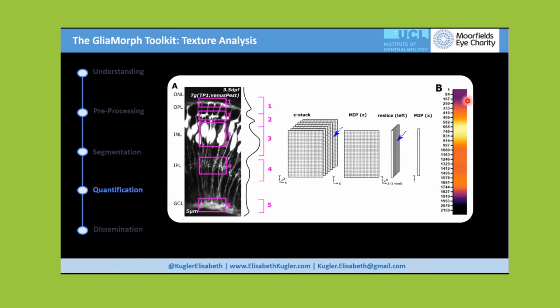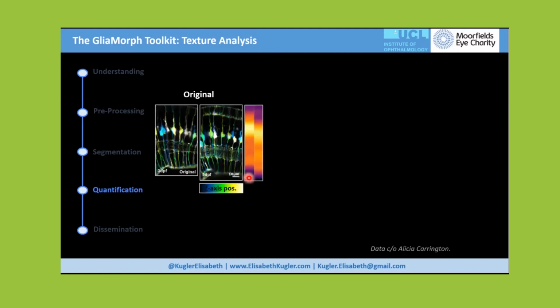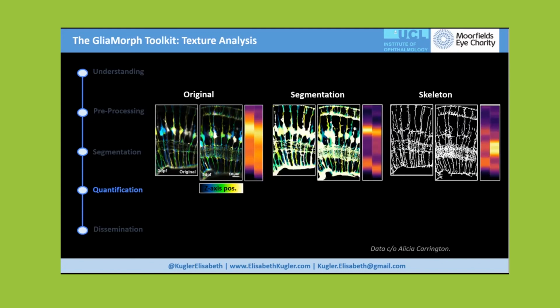And so again, to really study this first, we applied it to this data at 3 and 5 days post-fertilization, and indeed we see this downward migration of nuclei and an increase in height. But it actually becomes even more interesting if we do the very same thing for data that have been segmented or the ones that have been skeletonized.